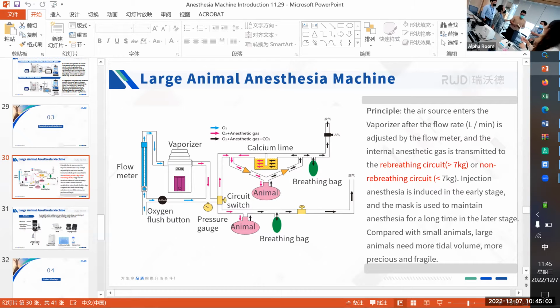So basically, what is the function of the ventilator when we have the air pump? What is the difference between the air pump and the ventilator? If we use the ventilator, will the animal wake up quicker than with the air pump? Because you said there is an O2 flush, it can make the animal wake up too, right? So what is the difference between the O2 flush and the ventilator?